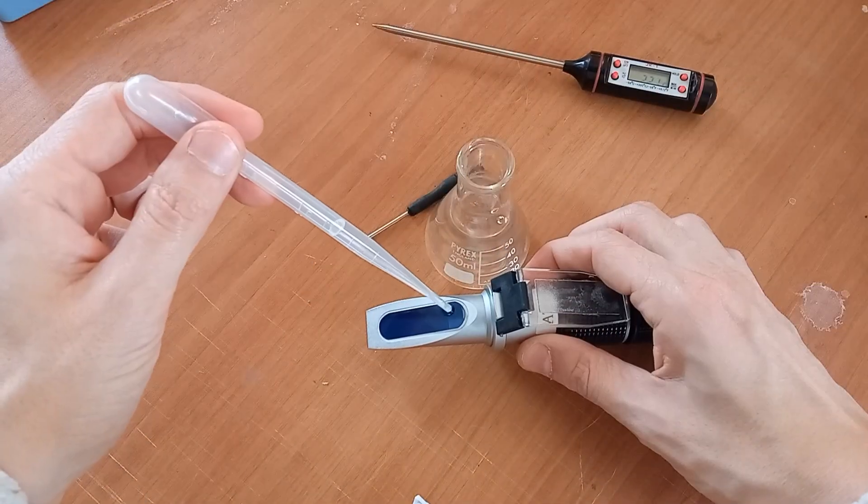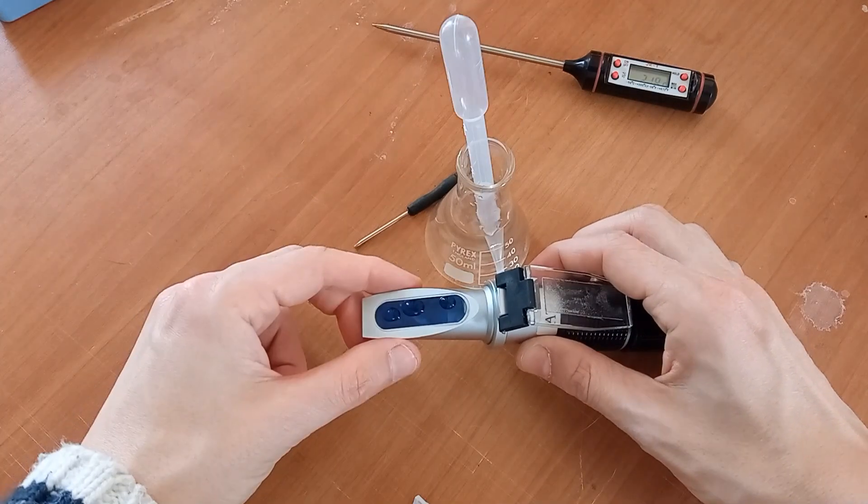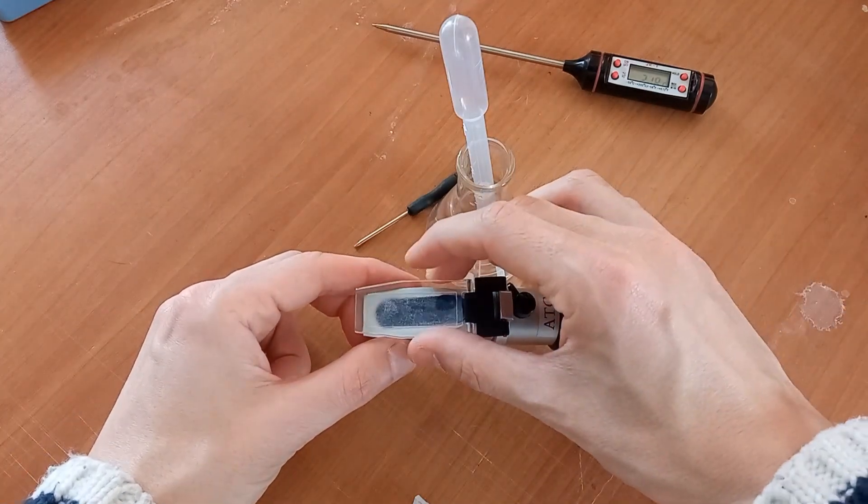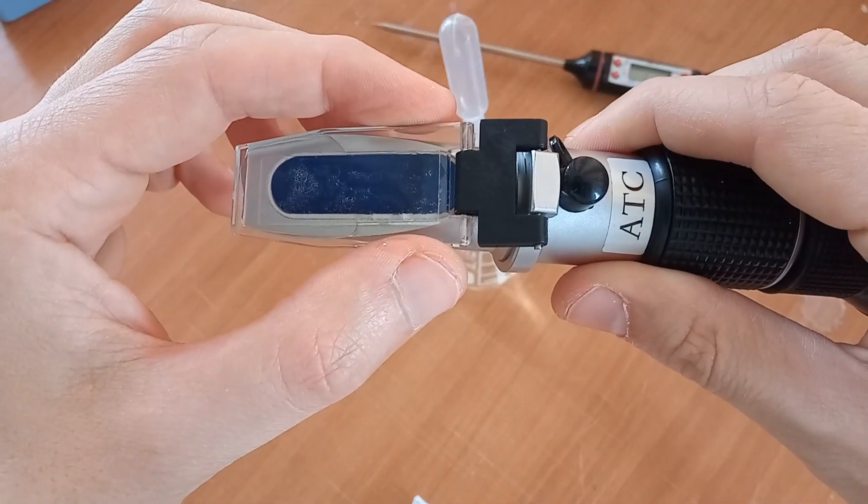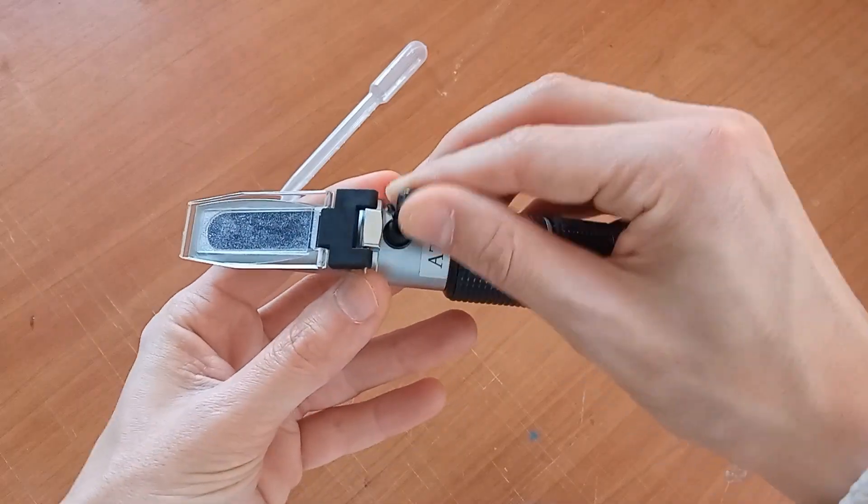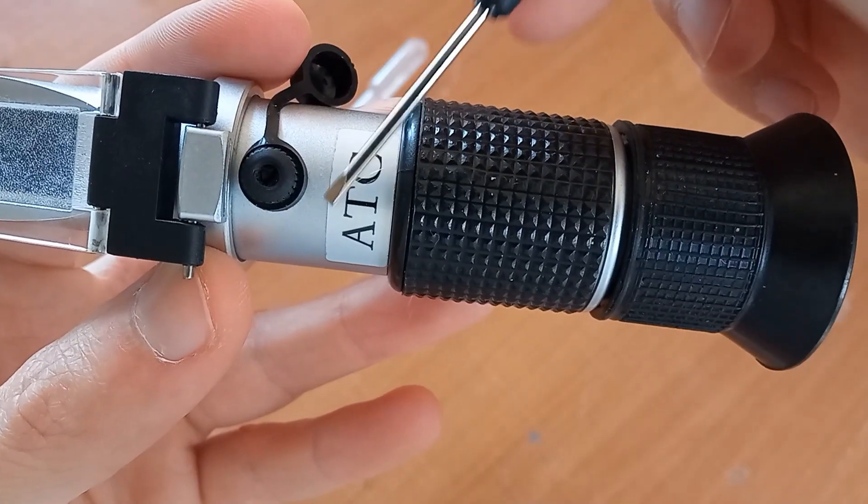Water at 20°C is dropped on prism. The cover applied. Care must be taken against bubbles. Instrument is then pointed towards daylight. With the screw, it is rotated until baseline is exactly on zero.